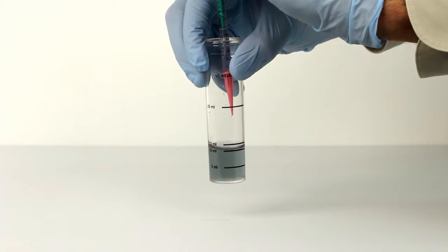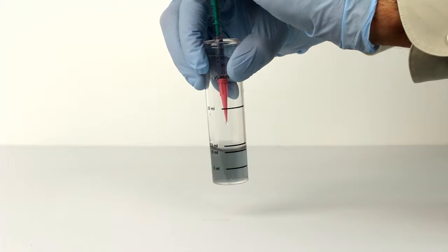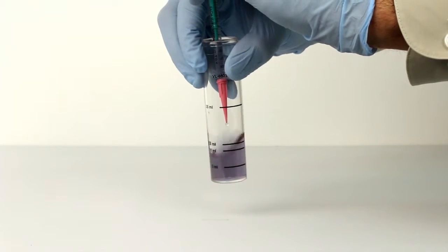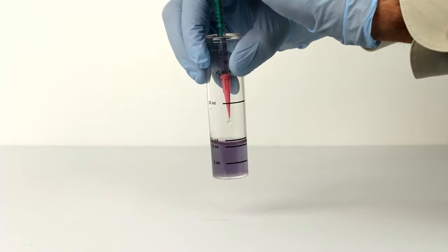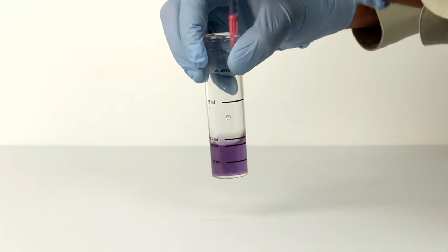Continue adding titrant until the sample color changes from green to purple. A gray intermediate color may develop. Keep titrating to the purple endpoint.